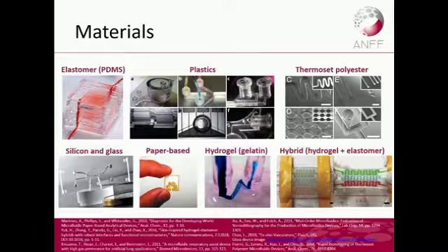These plastics here were 3D printed. The 3D printer has now become more commonly used equipment in microfluidics fabrication, which I'll talk a bit more about later. But probably the limiting factor at the moment for 3D printers is the resolution, how far down it can go. It depends on the actual 3D printer you're looking at. You can get down further, it's just that the price of the machine might be a bit hefty.